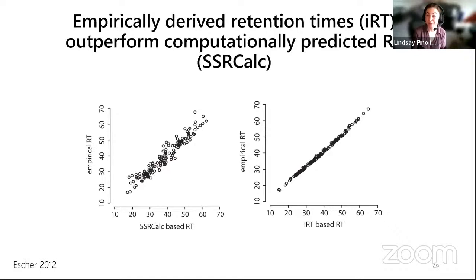Sometimes it doesn't look great and it's not something I would want to send a grad student or a postdoc chasing for their research project until I convinced myself. So absolutely agree. Manually curate afterwards. Sometimes what I'll do with DIA is I'll spot check a couple that I know should be interesting in my data, just to make sure that the software looks like it's working correctly.